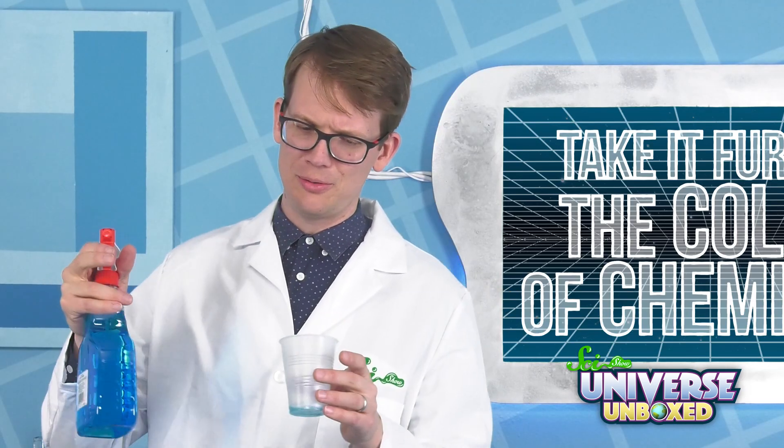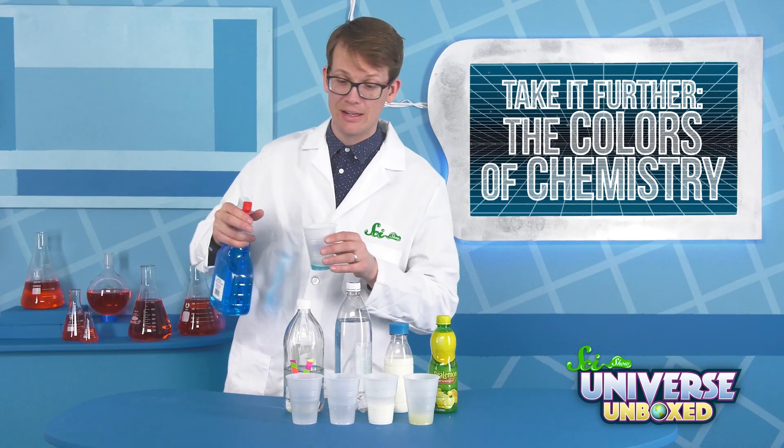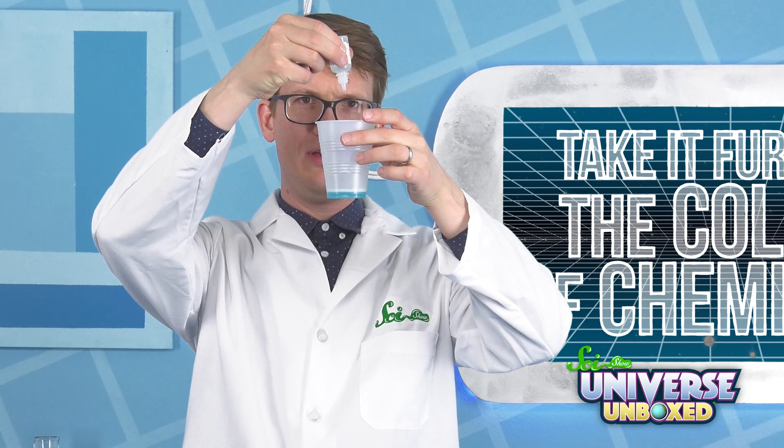As with all of the things we do here, adult supervision. Also, don't mix this with those things — that could go bad. So we don't need to put a ton in here. Let's just get one or two drops of phenolphthalein and see what happens.